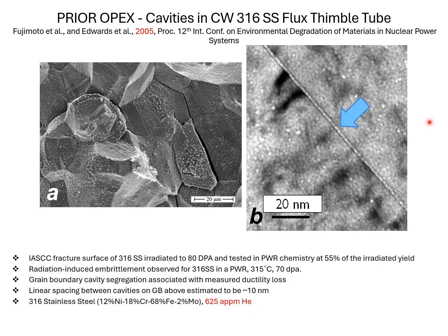And historically, a lot of the bubbles that exist because of the helium have not been identified, primarily because they're small, certainly at reactor operating temperatures, around 300 degrees C. They tend to be small, maybe less than 5 nanometers, typically 1 to 2 nanometers.